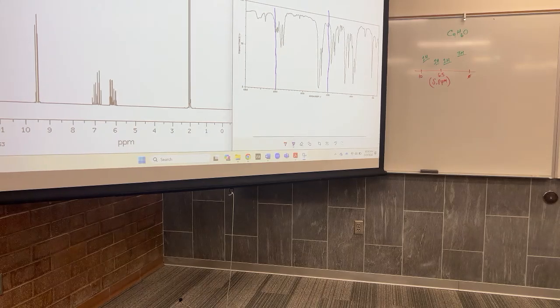So degrees of unsaturation tell us if we have pi bonds or rings, although it doesn't tell us which one we have. Okay. And I also wanted to ask you really quick. We did this one before, the ABC one. You were saying when H is attached to a functional group and they share a carbon, that would shift right. I know there are no shared heteroatoms in this one. Signal B shares a carbon with a heteroatom, and signal A shares a carbon with a heteroatom and shares a carbon with a functional group.